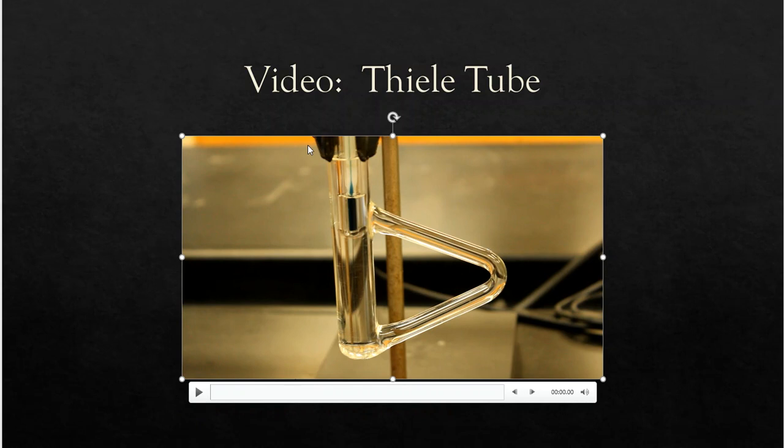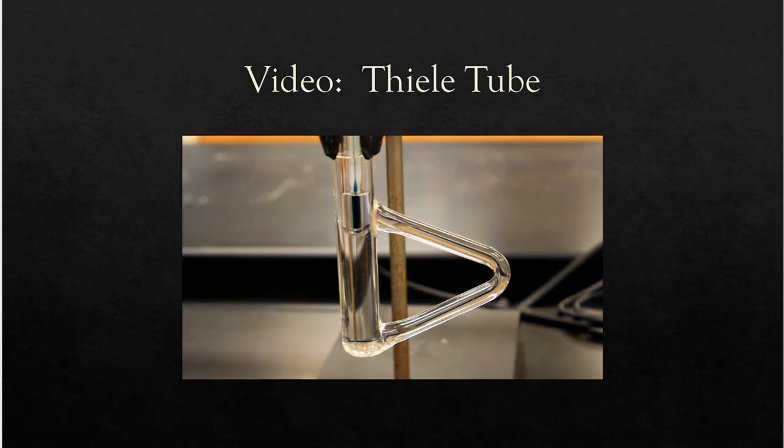All right, so there's my fancy Thiele tube. We spent about $50, $60 on a Thiele tube to bring it into our laboratory so that way we can make your life convenient. See how we always look out for your academic success.